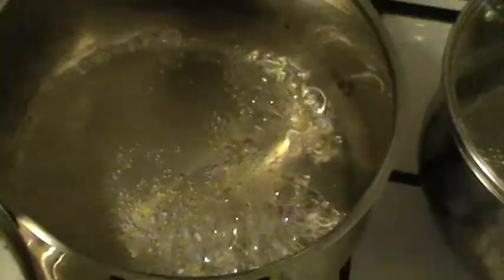I think, what, 6 minutes now already? Almost 6 minutes. Okay. It's been about 6 minutes now, everybody. And we're gonna have a look at the plain pure water. It's really bubbling a lot now. It's really past, it is at its boiling point. And as you can see, most of it is becoming steam.